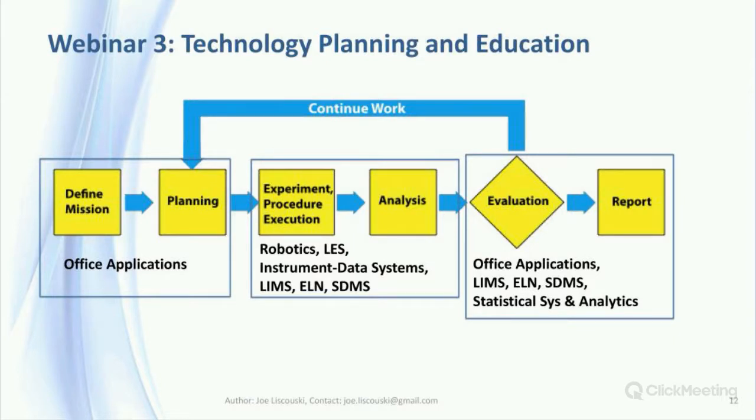This subject will continue over several webinars. We'll look at the methodologies for planning for laboratory systems. Where do you start, when do you start, and who should be involved? The roles of regulatory guidelines in different laboratories. The roles that lab management, personnel, and IT support groups play. The changes taking place in lab work and the backgrounds needed to be successful, and the effort needed to support the technical work in meeting ROI and performance goals.